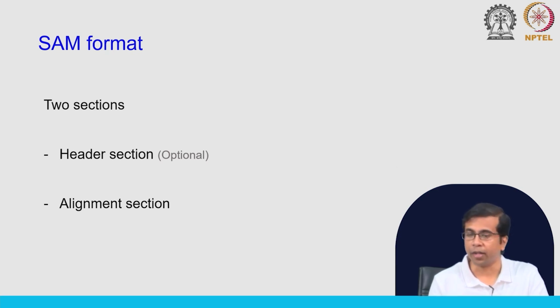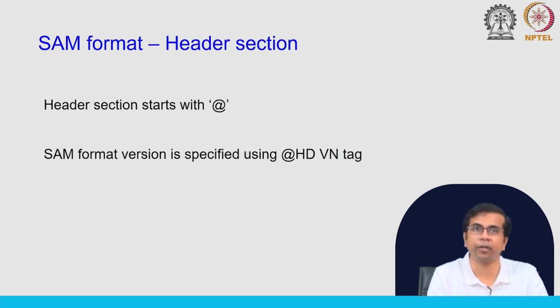Okay. So, let us look at the header section, what it means, what kind of information it has, and how you interpret this data. The header section starts with the @ sign. So, it is like the FASTQ format, where the header starts with @. We will see in the actual file that you have this @ sign.